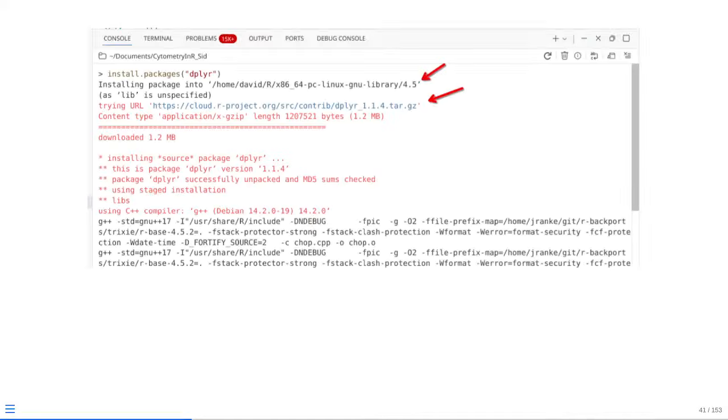So I don't want to go through all these different steps as far as what's happening. I'm not a computer scientist. I don't want to be a computer scientist, so I'm not interested in all the little steps. But I want to provide you enough context that if something goes wrong on a package installation, you know how to go about troubleshooting it, and you know kind of the basics of what's happening in the background.